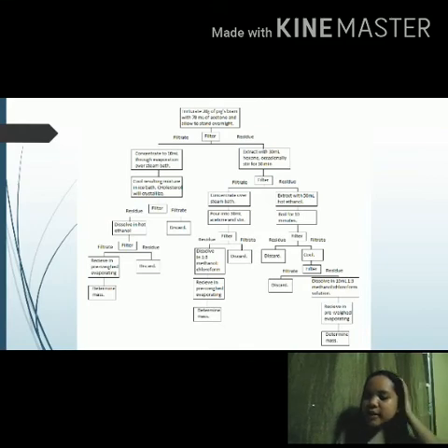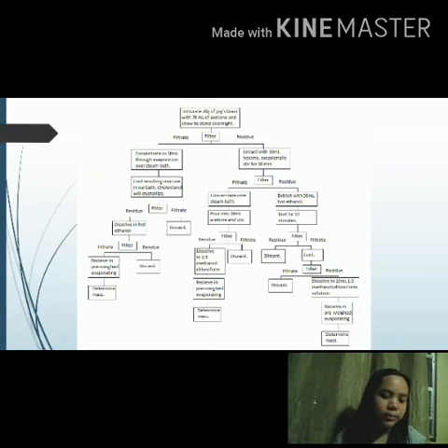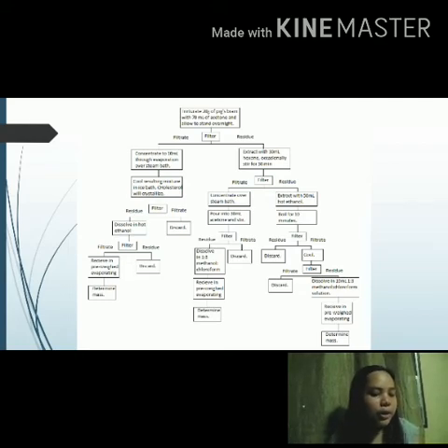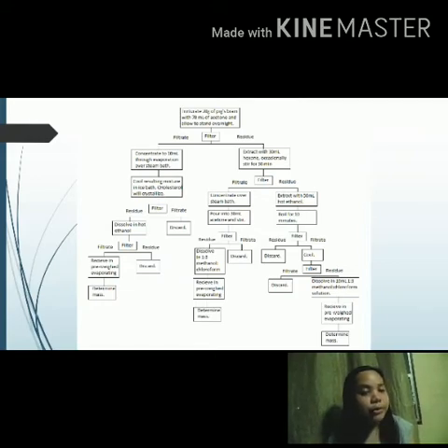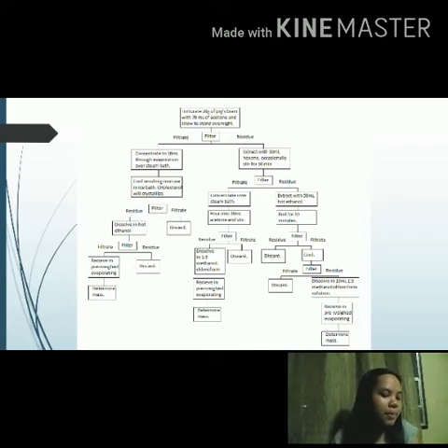So lastly is the isolation of the sphingolipids. The residue from the last filtration from the isolation of phospholipids was extracted with 50 milliliters of hot ethanol. To answer post-laboratory question number 6, the head of sphingosine is highly polar and bonds with ethanol, eliminating unwanted residues. And ethanol is more efficient with high temperature. That's why it was used to extract sphingolipids.